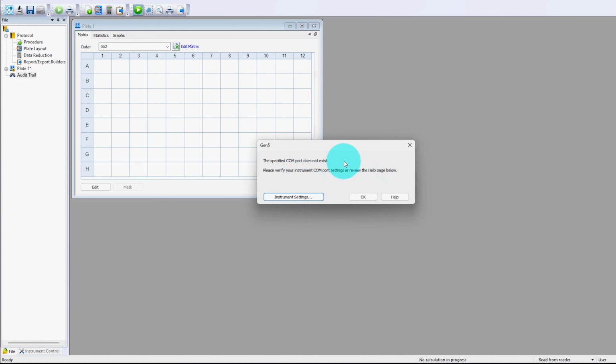So I'm just showing how to set up the experiment here in my system. My system is not connected with the machine. So I'm going to show you separately how we take the absorbance using the ELISA plate reader machine. So I'm going to close this.